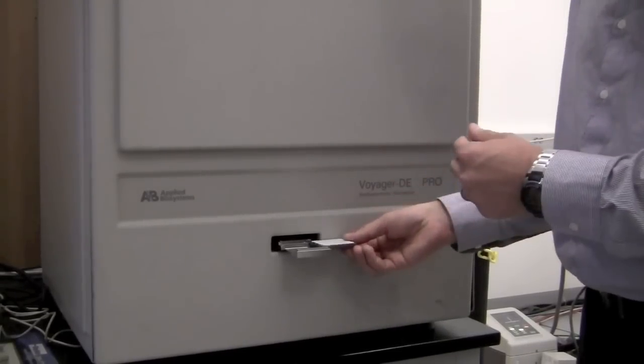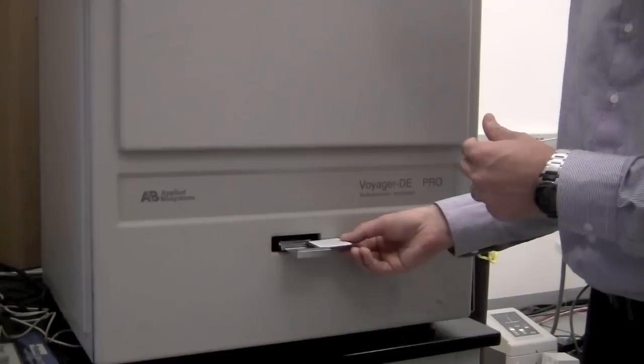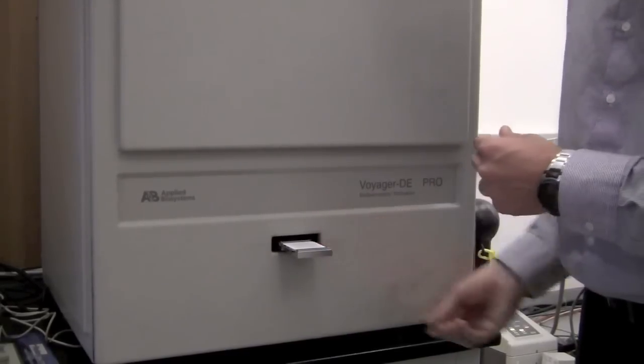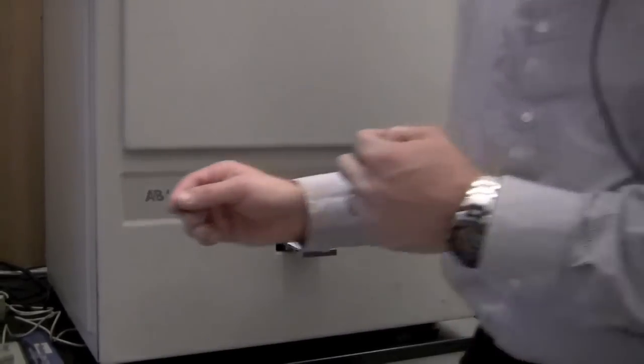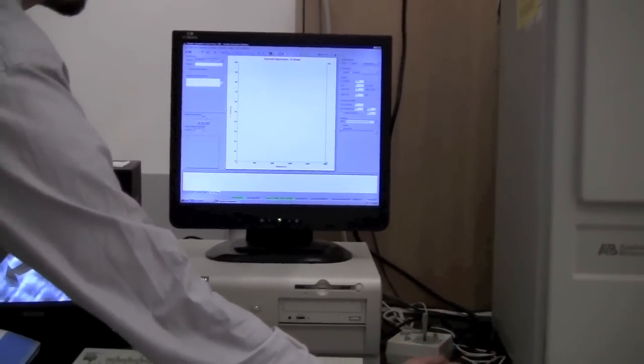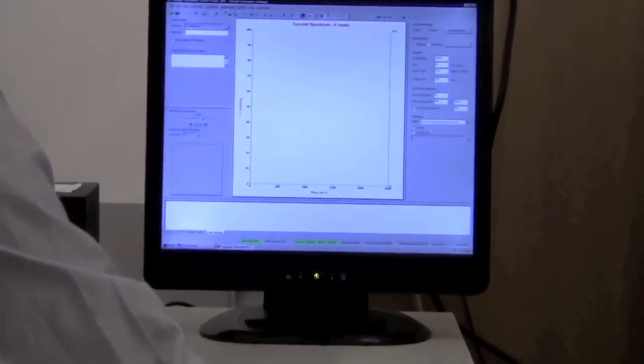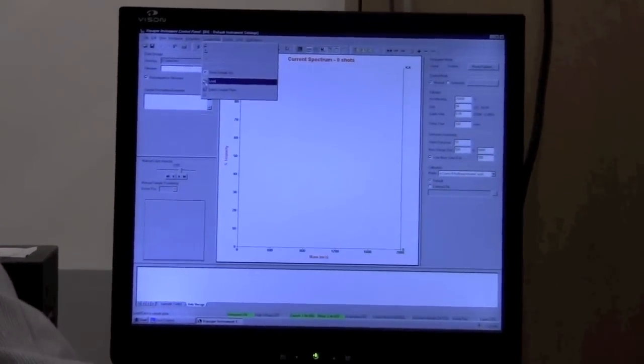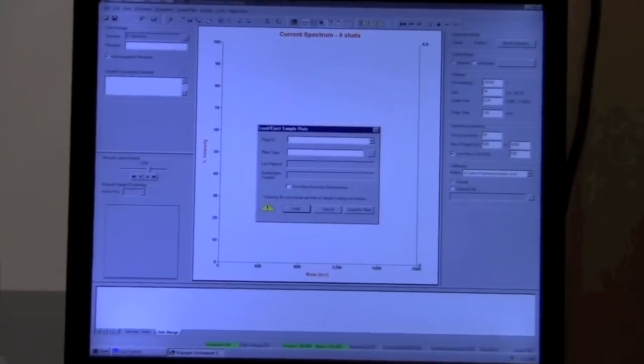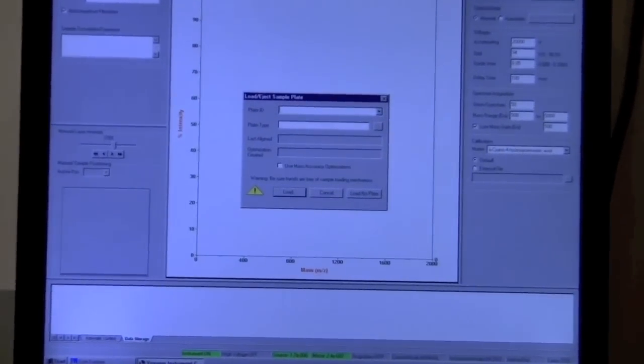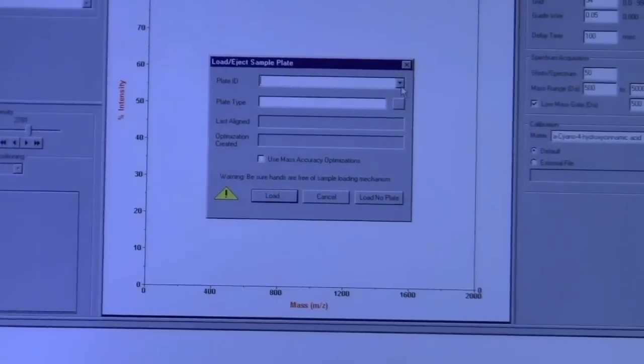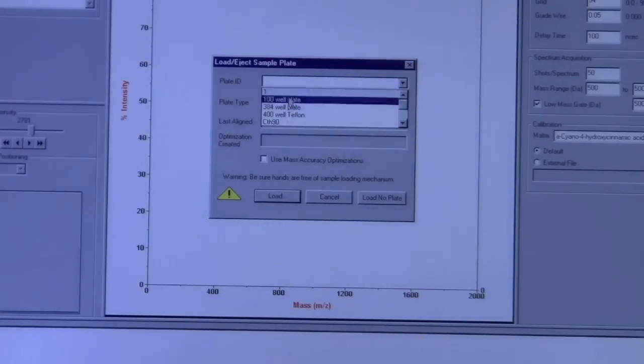So we will load it in correctly where it clicks, and then we'll go back to the computer. We're going to go back to sample plate, and we will select load. And here, under Plate ID from the pull-down menu, you can choose what type of plate you have.